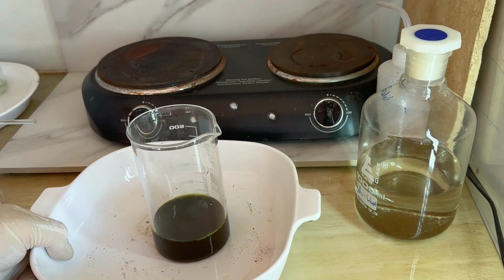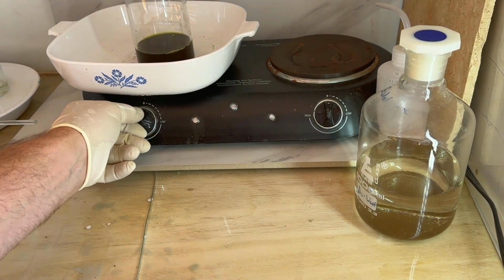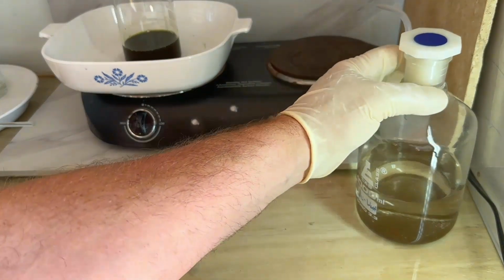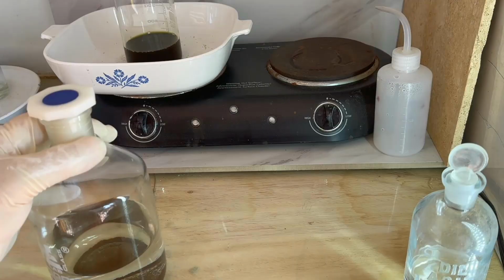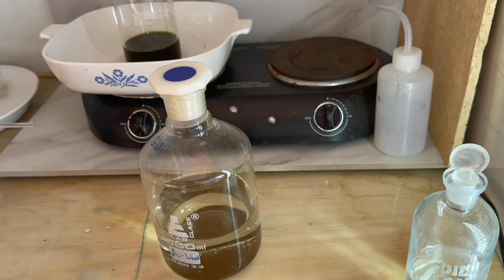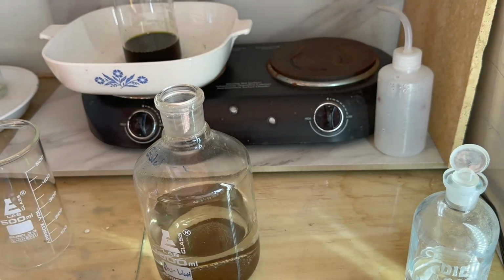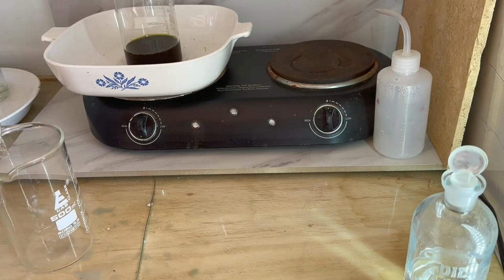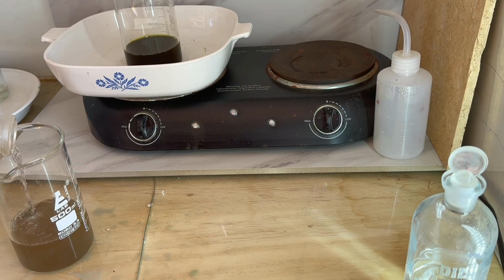All right, got that in there. I'm going to put it up on the heat, give it a cover, and let that start cooking a little bit. While that's going, take this. We need to drain most of this liquid off. Diluted Aqua Regia works a little bit if you leave a little in there, but there's way too much liquid in there. So we're going to put it into this beaker. I'm sure this powder is very fine, so some of it's going to come over. I don't really want to filter all of it, so I'm going to get most of it off. We'll filter the little bit that comes into the beaker and add it into the process, but we'll get most of it out of here and get it started as well.